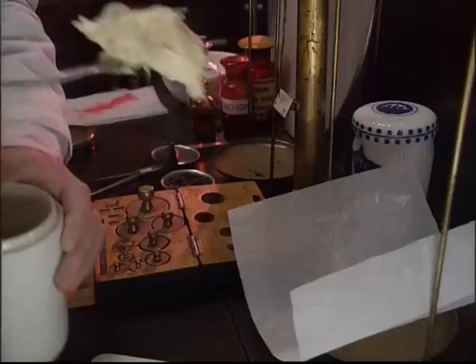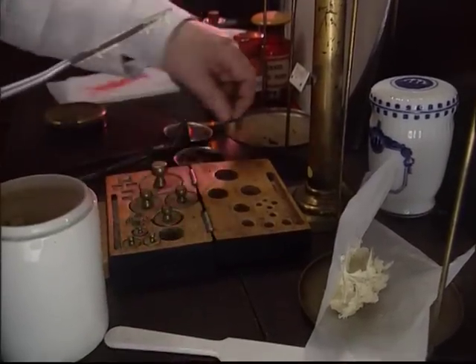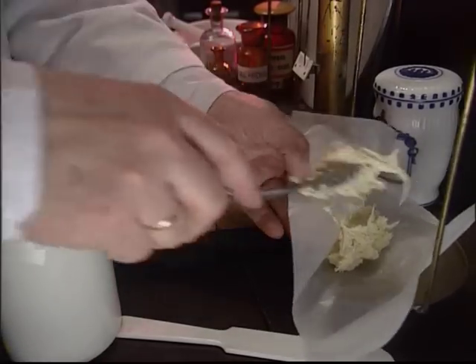Ointments have differing consistencies. There are those which are like butter, those which have a more paste-like consistency because they contain non-dissolvable material, and creams, which are soft. We'll make a mercuric iodide ointment. The pulverized mummy and ointment from the executioner were a curiosity in the history of pharmacy.